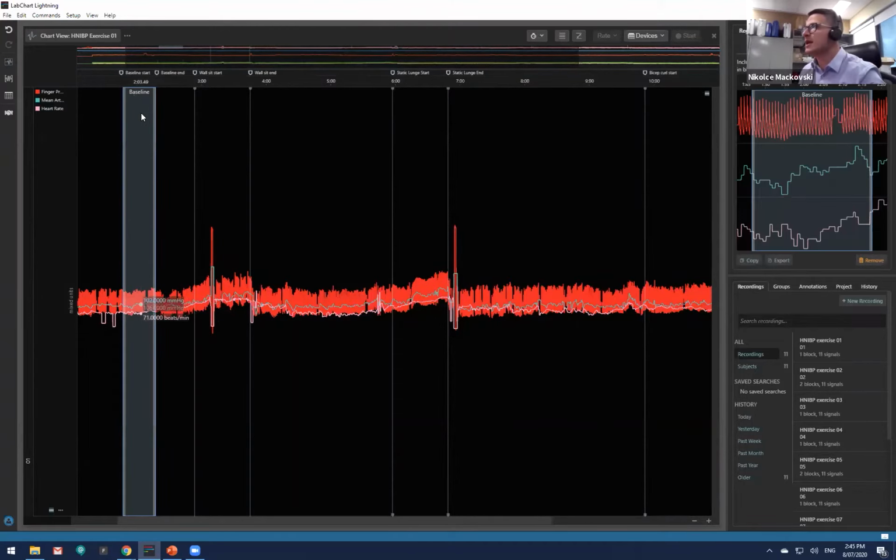Other options here is you can actually remove your region by clicking on remove, and you have other options here of exporting. What these options provide is I can either export as a text file all my data, or have the option of actually copying what this is. Copying is a really powerful tool, I find, especially when you are pasting something in Excel.